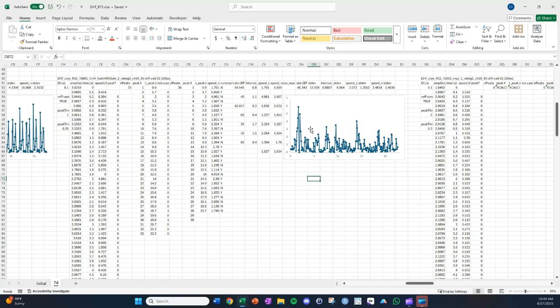So this seems like a beat. This seems like a beat. 1, 2, 3, 4, 5. Maybe something there, unsure, but 6 for sure here. 7. So 8-ish beats, I would say. So I'm just going to put the number of peaks I would expect, which is about 16. Might be a bit higher than that. Maybe it'll be more like 18, but we'll find out.